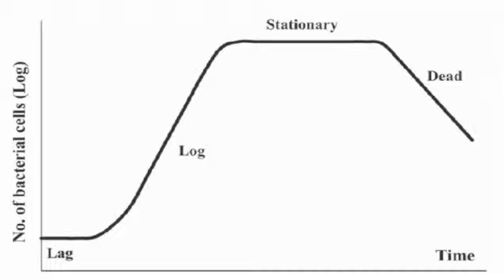This figure gives a typical bacteria growth curve cultured in media. This figure illustrates the lag, exponential or log, stationary, and death phases of bacteria growth. The kinetic parameters for bacteria growth can be derived from this curve.